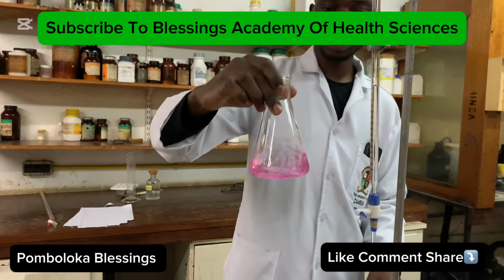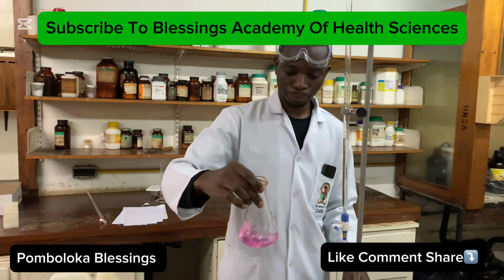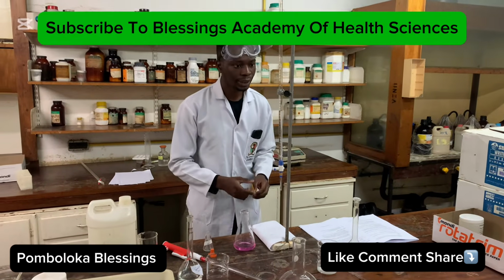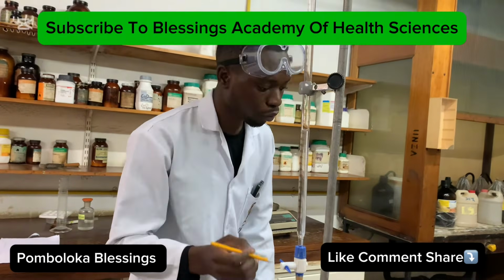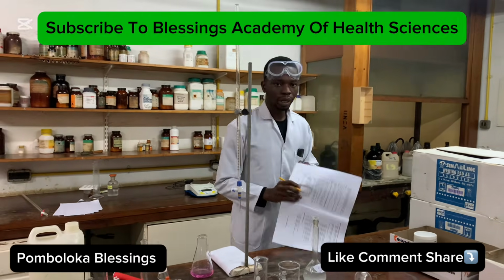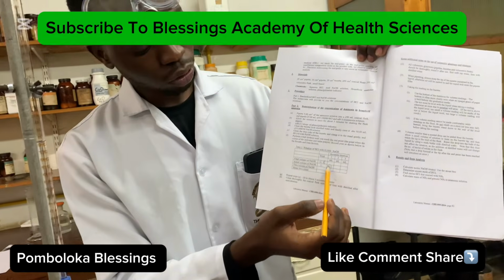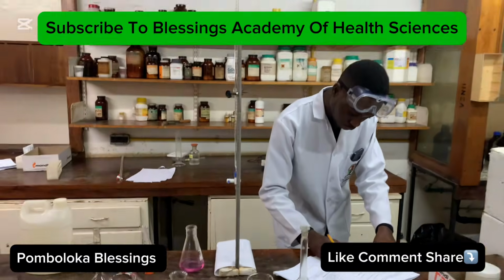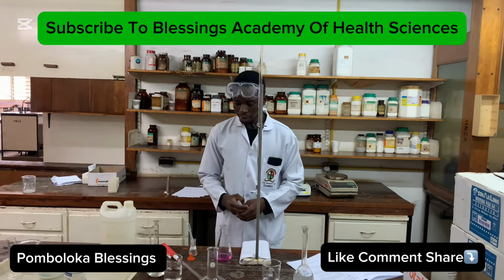All right, there we are. So we can see that there's a color change there. Now, remember the initial volume of the sodium hydroxide was 16.8. Where are we going to? We're now at 35.4. So in the lab manual you're going to record the initial volume as 16.8 from the first trial, and then your final becomes 35.4 mLs. So that is the second part of the titration.